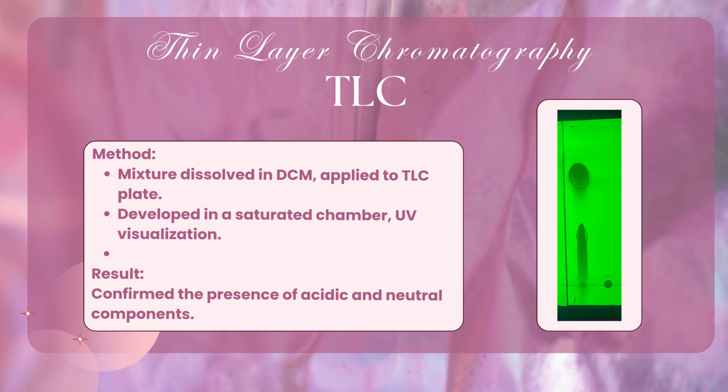So this preliminary observation was crucial as it guided my further separation and identification. Because after I was done with this TLC plate, I observed that my unknown compound consists of acidic and neutral components. And furthermore, TLC essentially confirmed that I was dealing with a mixture of compounds that had distinct polarity. Hence, I can proceed with the specific identification work for the neutral and acidic parts.